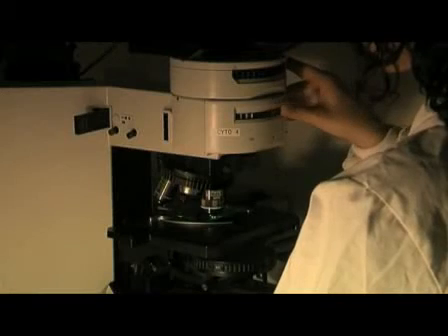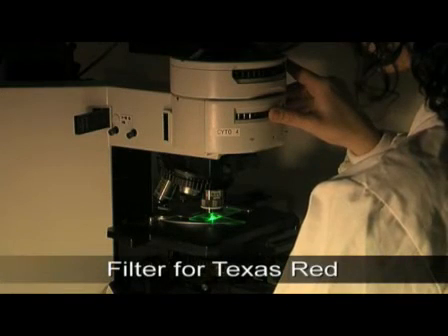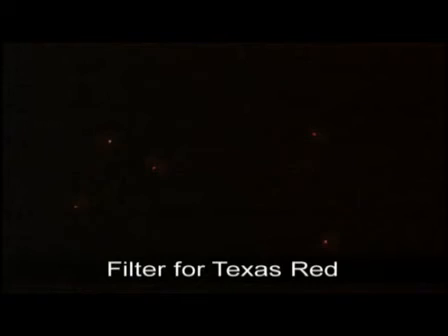The single band filter for Texas Red allows us to specifically visualize the signals for chromosome 21. All normal spermatozoa should display one signal for each one of these two probes.